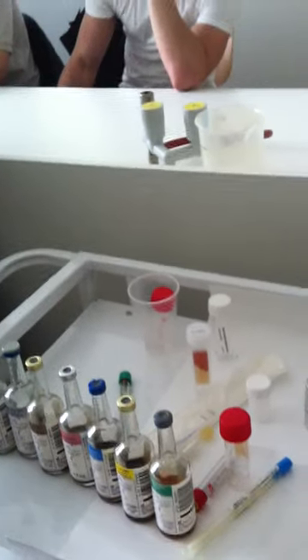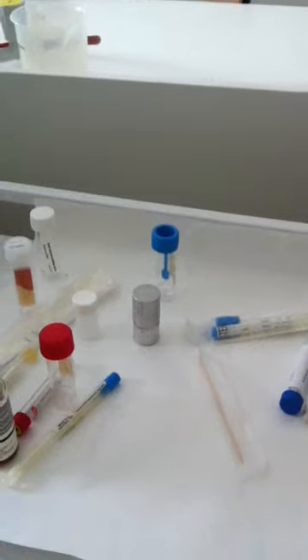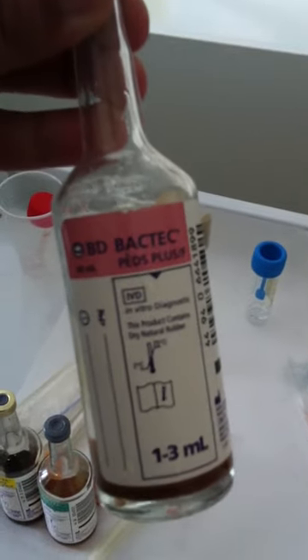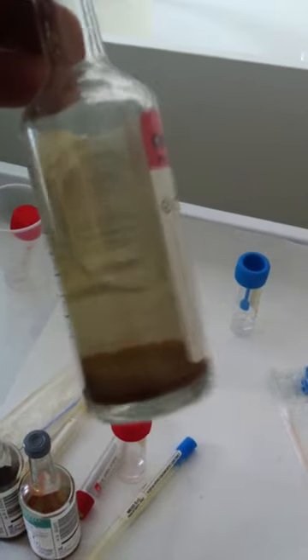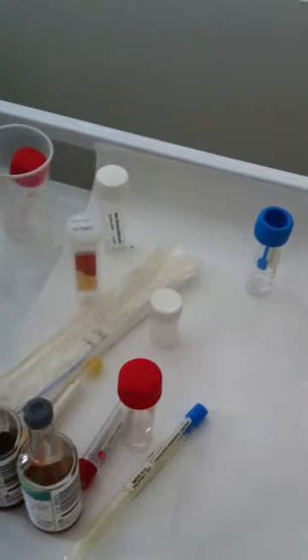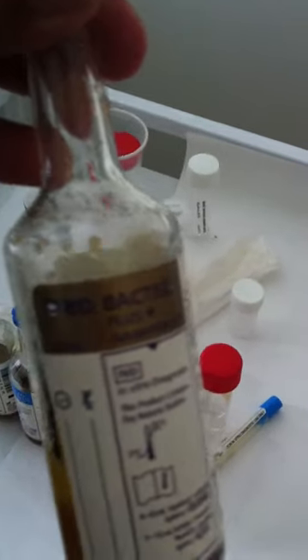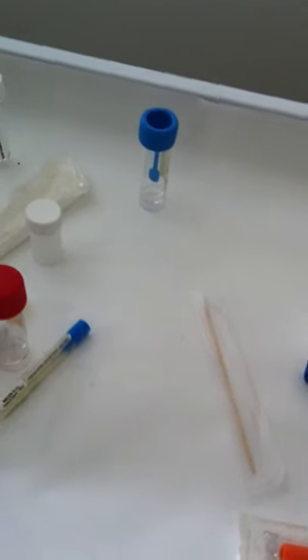Or you can also put it into the minus 20 and you can transport it according to the very specific boxes. This is better than nothing. I think sometimes there is no other possibility, because for example there's a small village or I don't know for another reason. But not recommended.